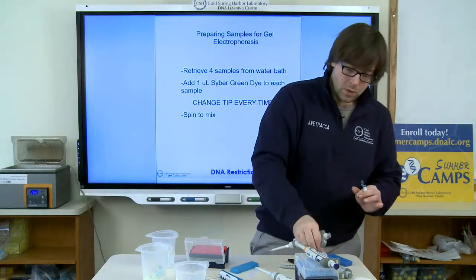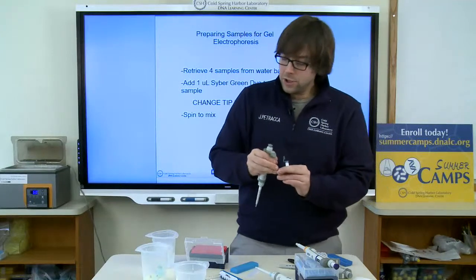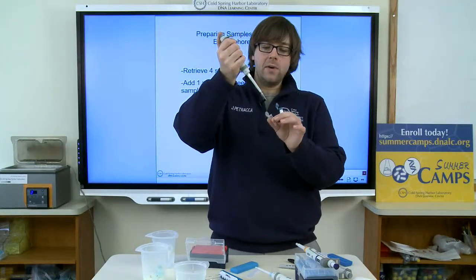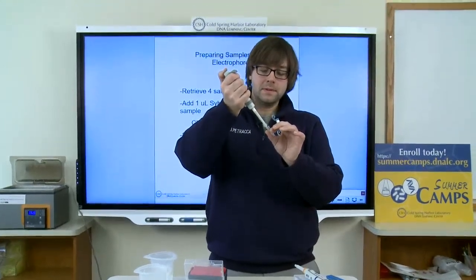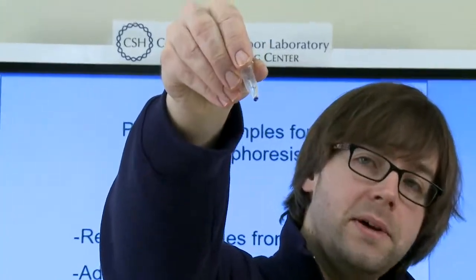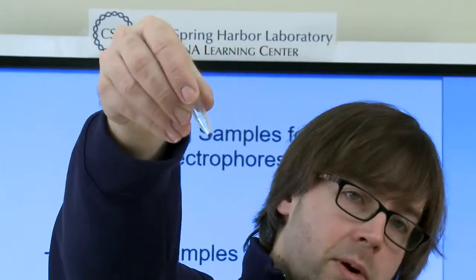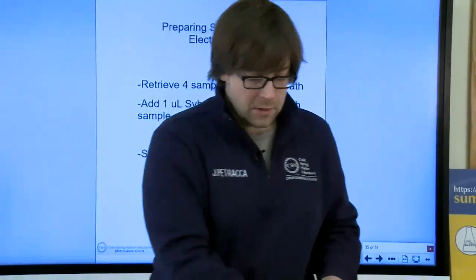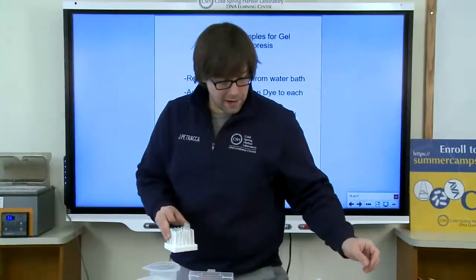Once we've added our dye, you'll notice that what used to be a clear solution is now blue. It actually has some color to it, so we can see it now. Check that out. You can see that the liquid is now blue. This will help when we're trying to load our samples into the gel. So let's get that taken care of.